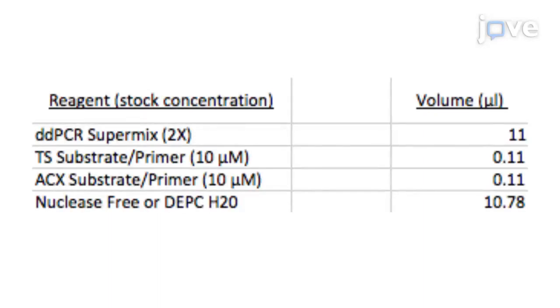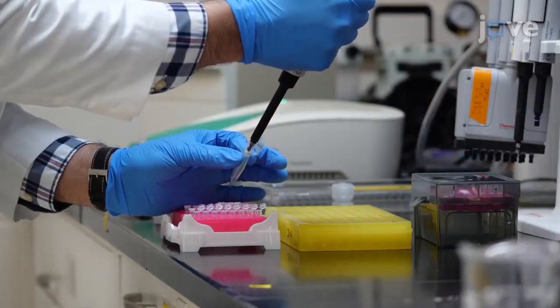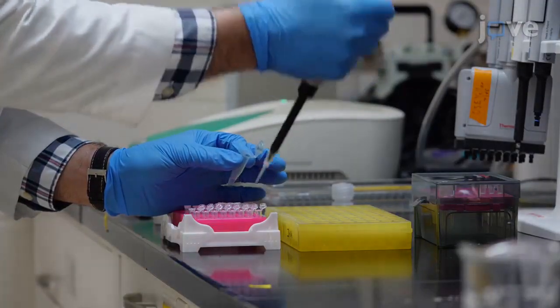Prepare a master mix in a microcentrifuge tube for the DDTRAP and keep it at room temperature. Pipette 19.8 microliters of DDTRAP master mix into each PCR tube.